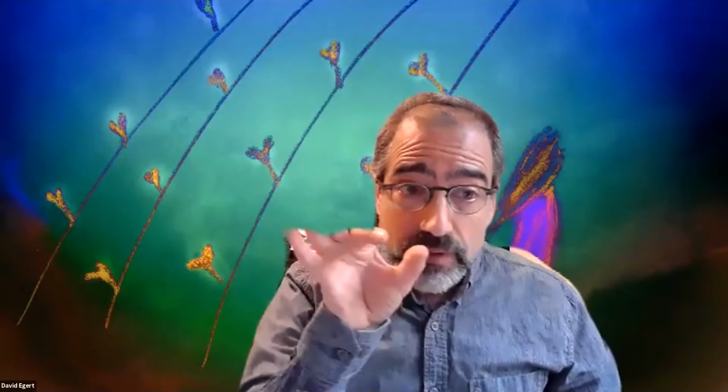One is just looking at the electrolytes in the little beaker. What does it look like? Spoiler alert, they all look kind of like salt, like little white crystals. Then you're going to add a little water and see, do they dissolve?